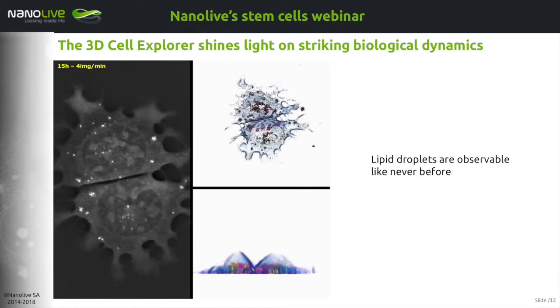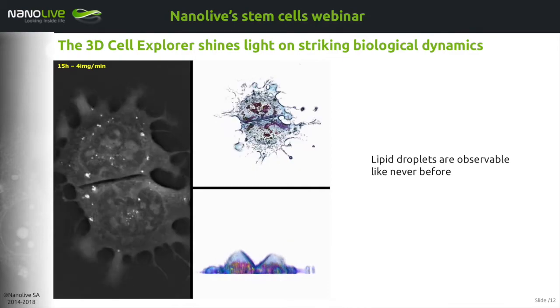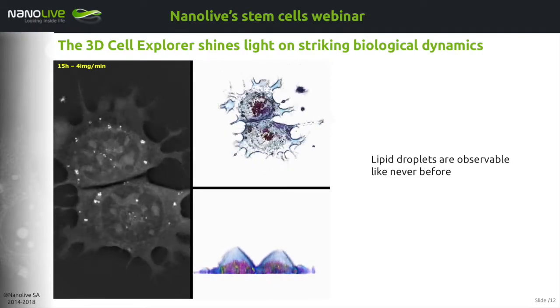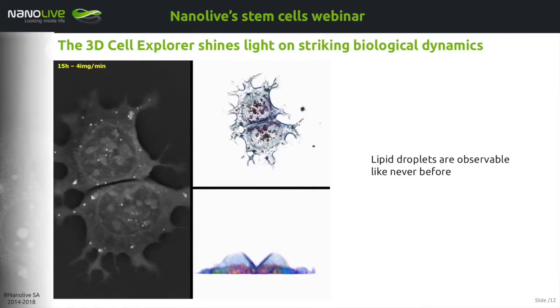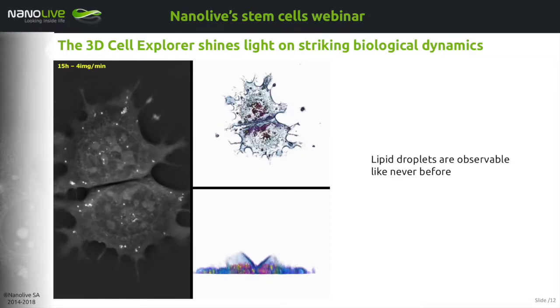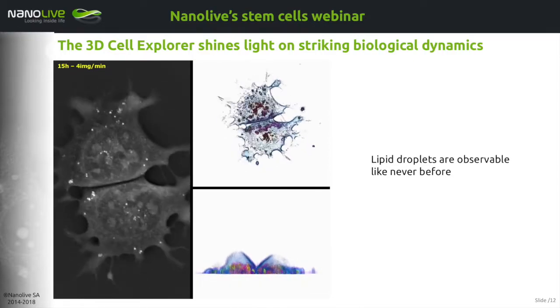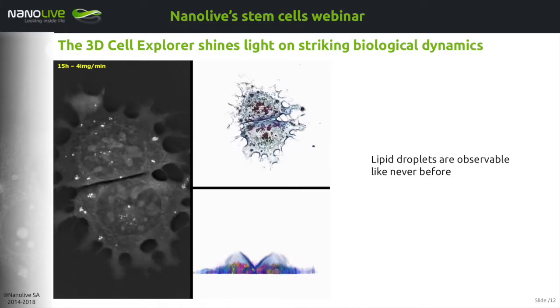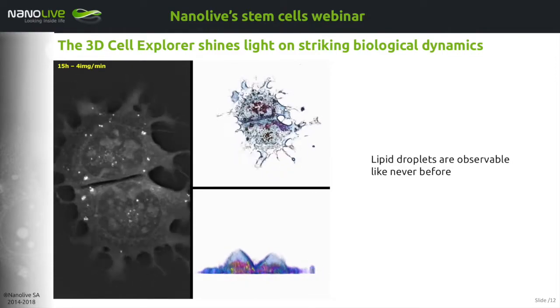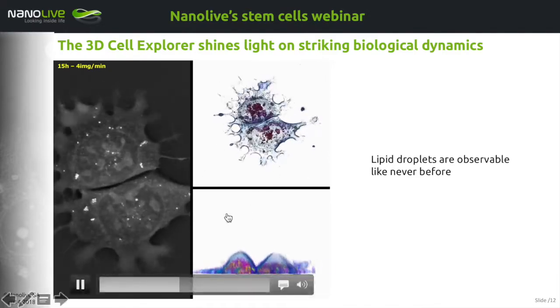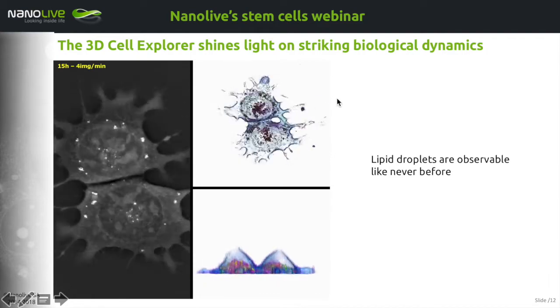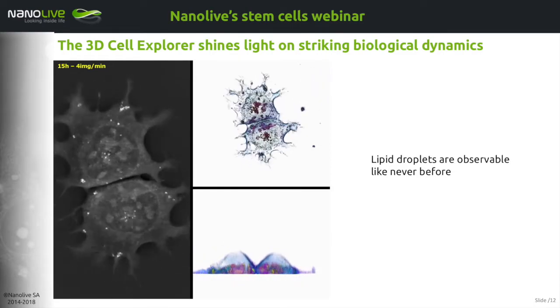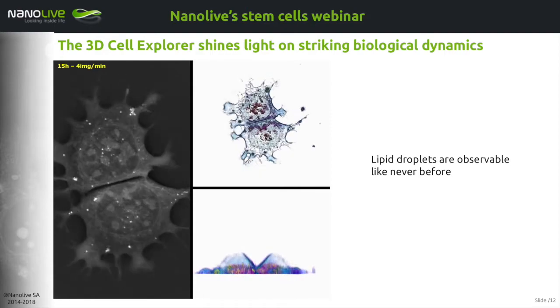Seeing them moving and growing is a major challenge. So far, lipid droplets were imaged using BODIPY, which are fluorescent markers that go specifically within lipid droplets and give them a fluorescent signal. Such approaches allowed the discovery of many things about lipid droplets. However, staining with BODIPY perturbs lipid droplet biology, and the observation with fluorescence microscopy, because of phototoxic stress, greatly limits the duration of movies and the frequency of acquisition, such that the dynamics you observe here were never accessible before. With our device, one can follow without perturbation the dynamics of lipid droplets — how they move, how they distribute in the cell, how they grow, fuse or undergo fission.